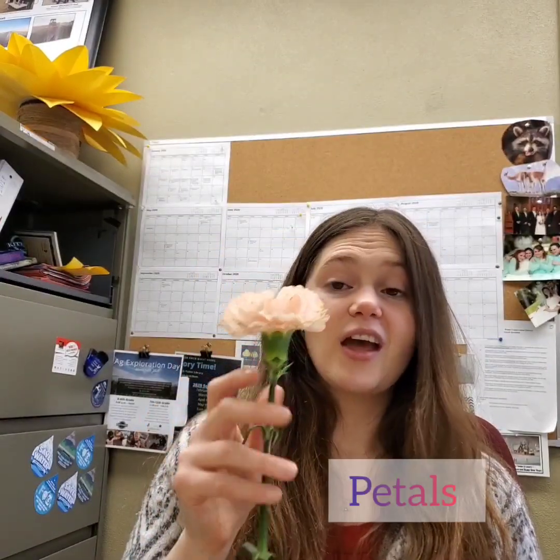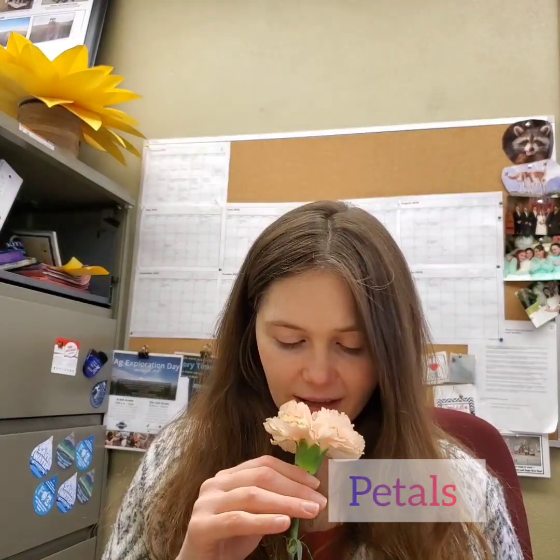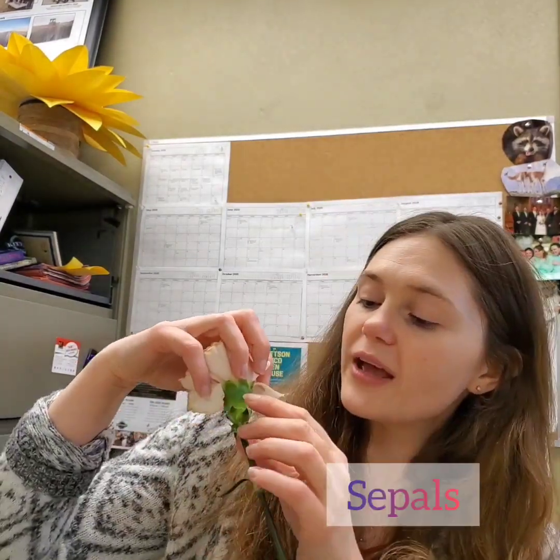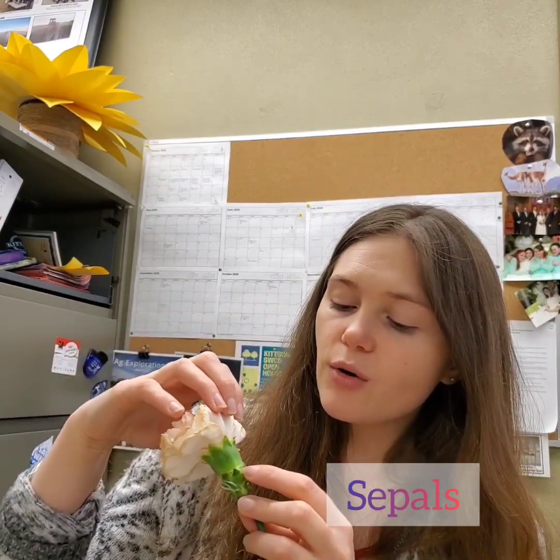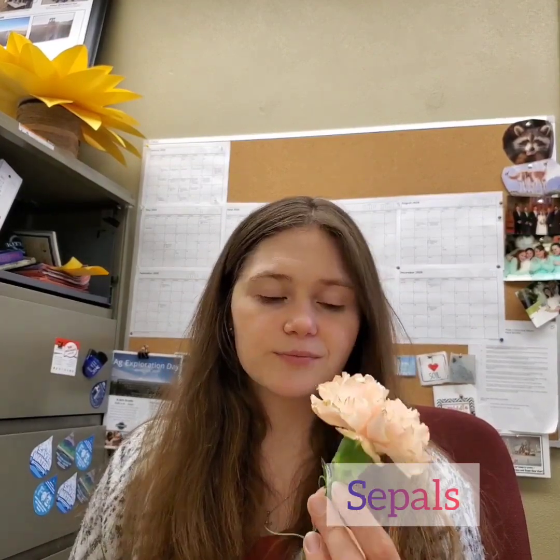Farmtown Floral was gracious enough to donate flowers to us for this lesson. This is a carnation. As you can see, here are its beautiful pink petals, and it has a delicate light fragrance that attracts pollinators as well. Underneath the petals, we have the sepal. These sepals are what protect the flower. So now we're going to take this beautiful flower and we're going to tear it apart.